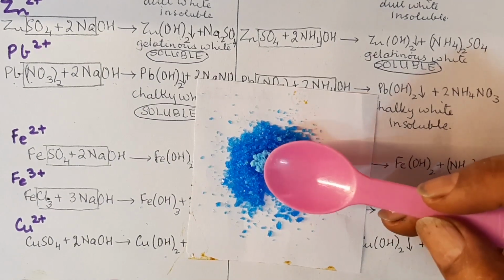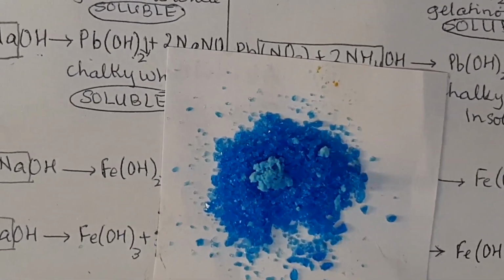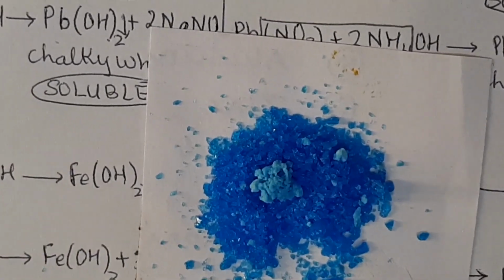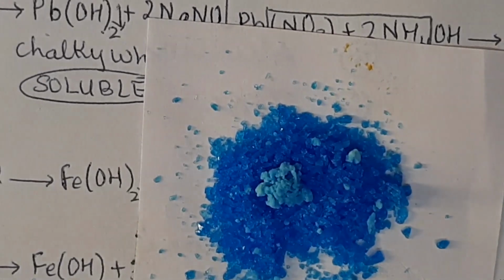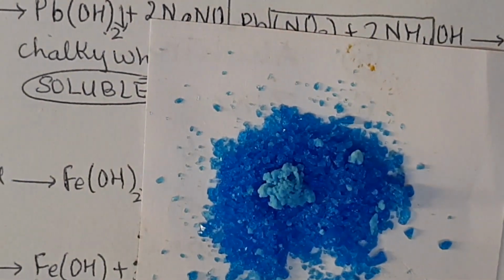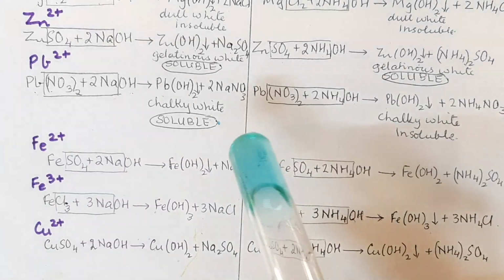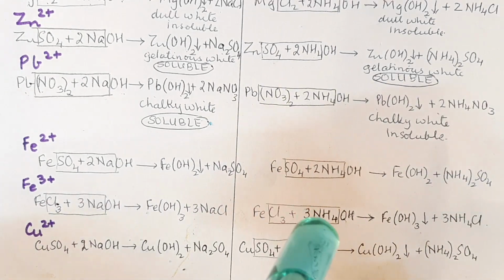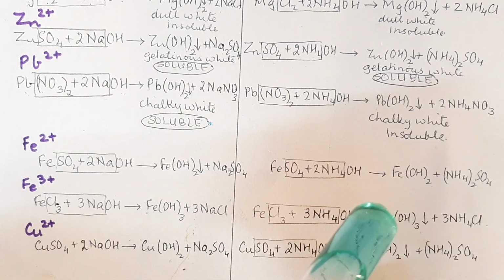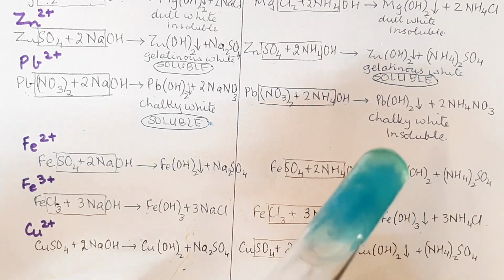Can you see this is matte finish over here? I'll just zoom in so that you will be able to see it better. There. You can see the matte finish of it, and it has become anhydrous CuSO4, that is copper sulfate. Now here we have a test tube with copper sulfate solution. I have dissolved it in water and I'm adding NaOH, sodium hydroxide first little.